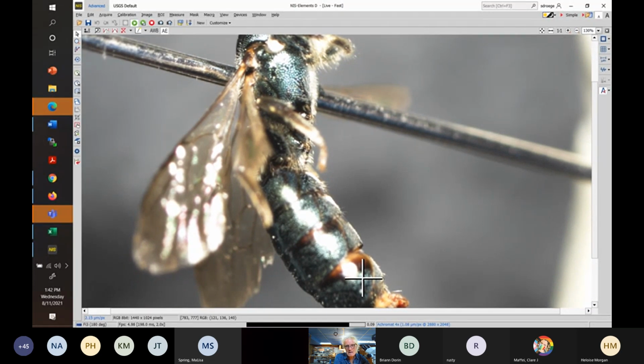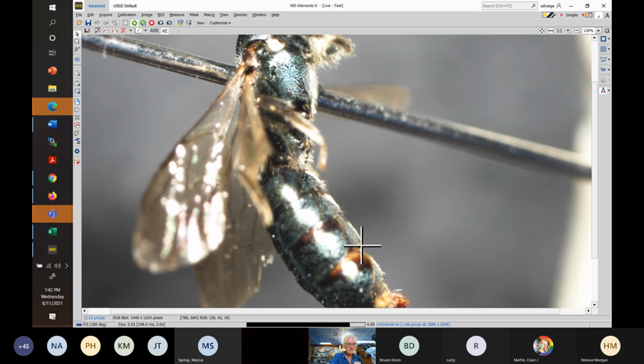Basically in micheneri, particularly on this S3, S4 area where I spend most of my time looking for hairs, there is almost none. You get, if you can see right here, a few little hairs, but basically nothing like the amount and number of hairs. You wouldn't say that was absolutely furry, but the contrast between the two is quite dramatic.